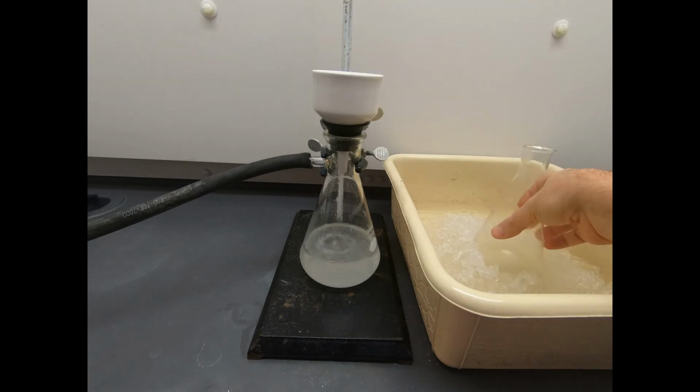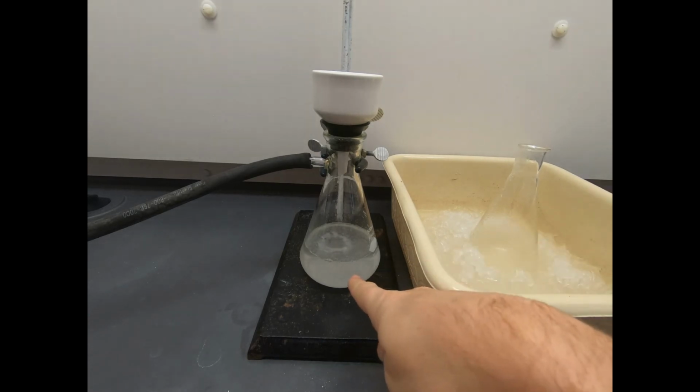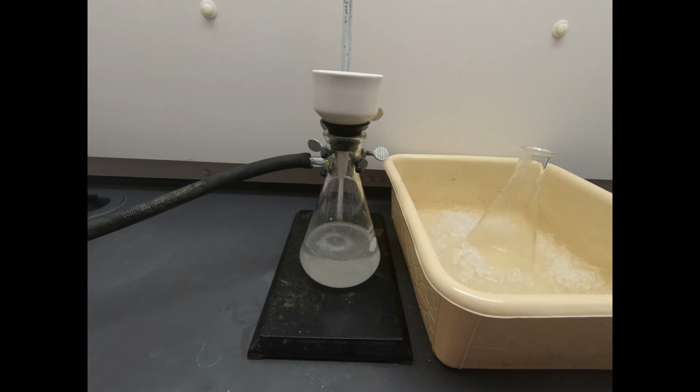Okay, that's the last of that. We got a little ice in there. Not always the best thing. That is one problem when you cool things on ice and you pour it out. Sometimes the water from the ice bath will drip into your solution. Now, for us, the solution we're filtering is essentially ice. Who cares if we get a little ice water in there? But if we are filtering a solution of ether, we may really want to take better care and maybe dry off that flask before we turn it virtually upside down to pour into the funnel.